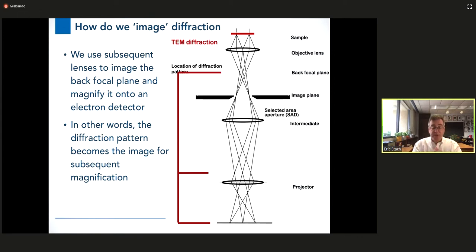So just to clarify, if you're looking to do that within a beamline at NSLS2, you would need to go to a beamline that's set up for doing diffraction. It's not possible to then subsequently image, right, the same areas.